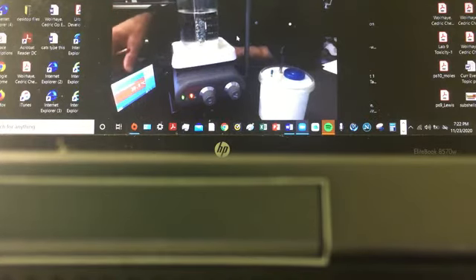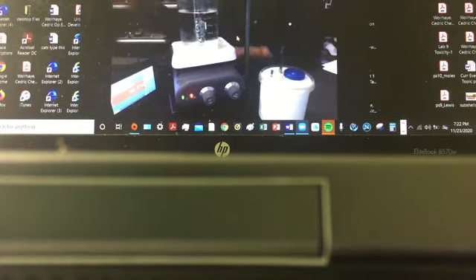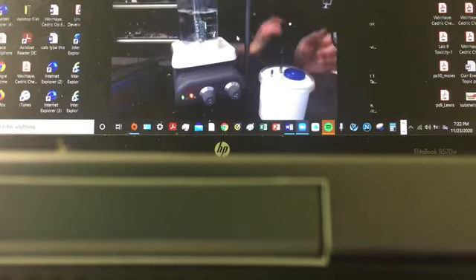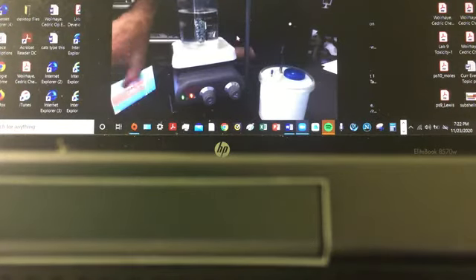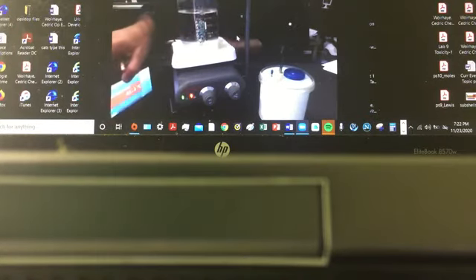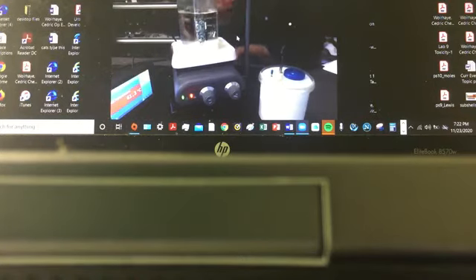Alright, so far the temperature is still under 40. So it's going to take a while. The temperature of that hot metal is achieved or transferred from the air above it. What surrounds that tube is water, boiling water. What's inside that tube? Just air and the metal.